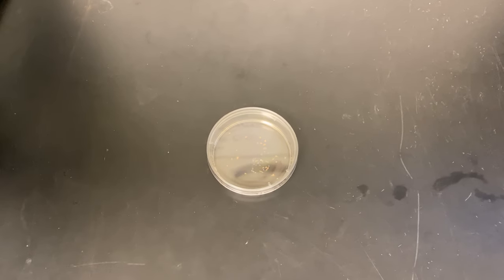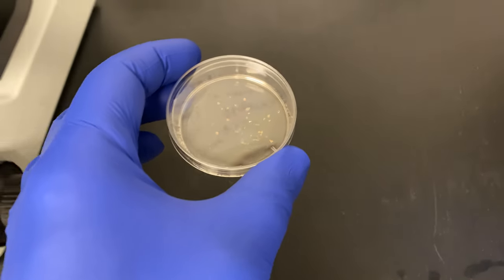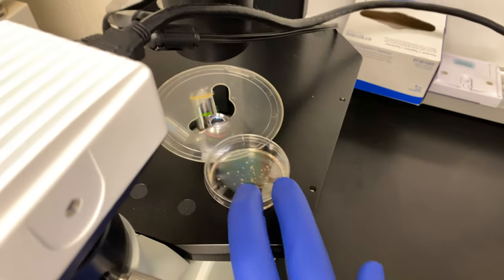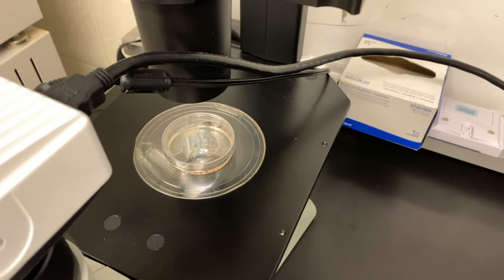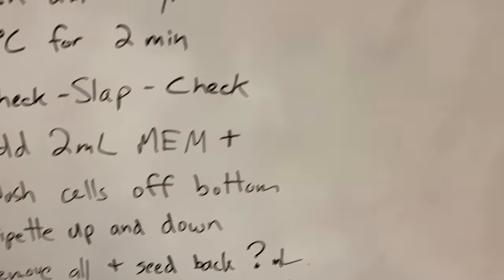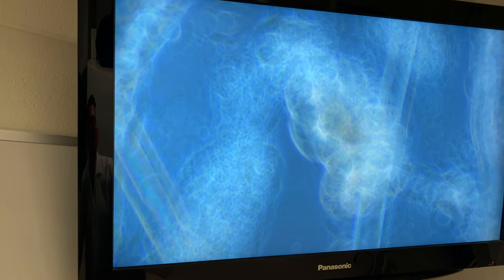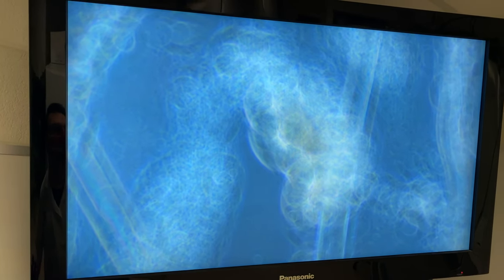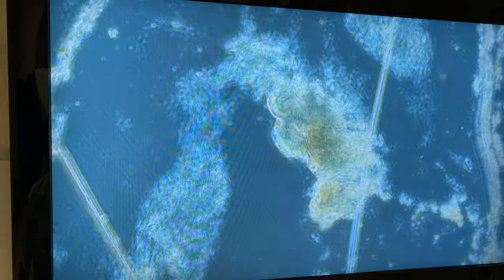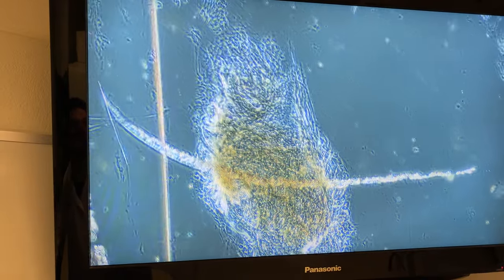Here is the explant plate from one of my students in the class, about a day or two after the explant was created. We will place this on our inverted microscope — it's connected to a camera and to a monitor in the lab — and we can view this at low magnification initially. We'll bring this into focus and take a look at the explants and the cells. These are heart cells, and you can see we had success here.